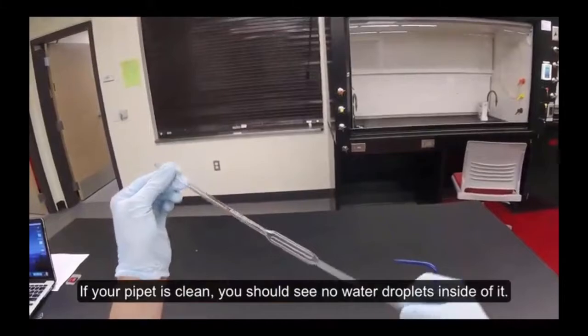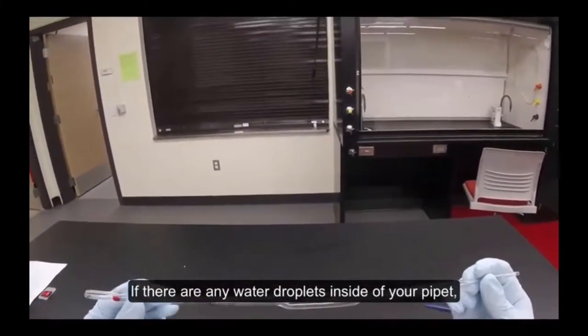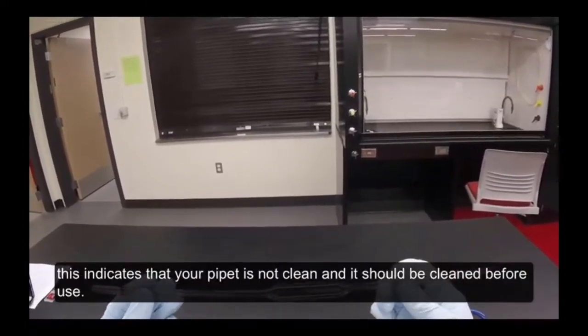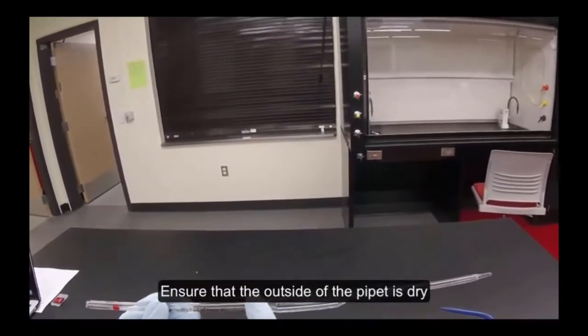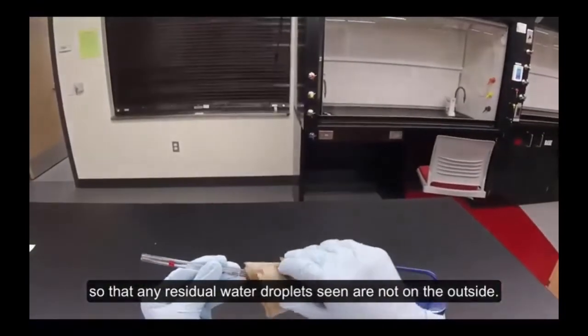If your pipette is clean, you should see no water droplets inside of it. If there are any water droplets inside of your pipette, this indicates that your pipette is not clean and it should be cleaned before use. Ensure that the outside of the pipette is dry so that any residual water droplets seen are not on the outside.